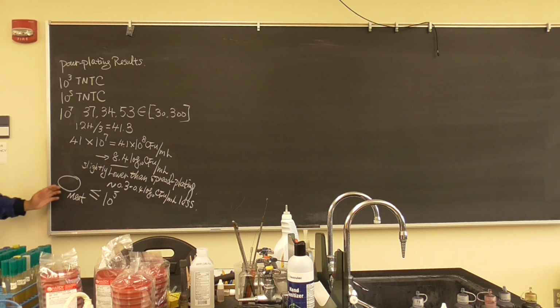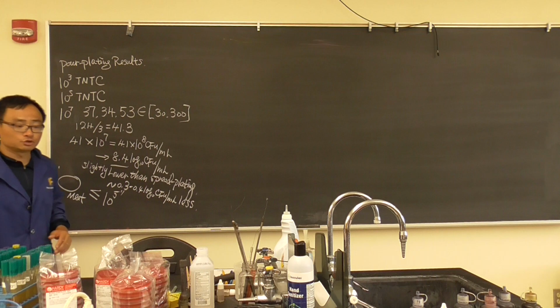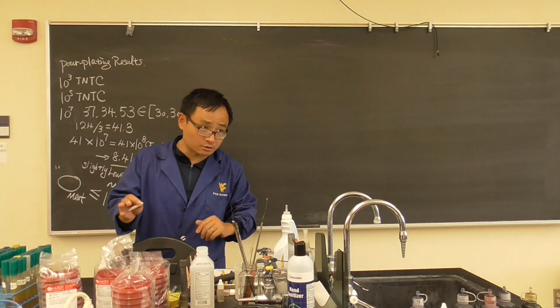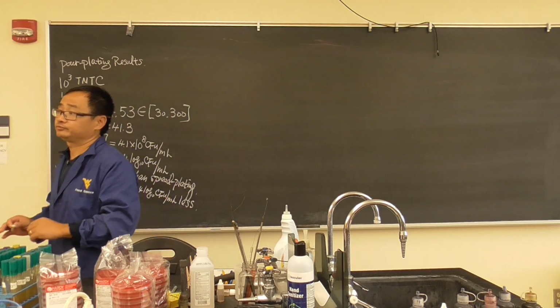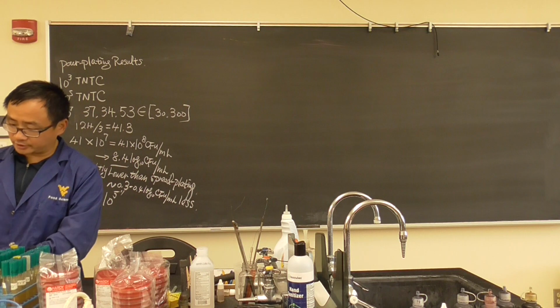So that type of thing is why people want to use pour plating. It did save you a day to make the media. However, you can compare the results, not that good. And it's even confusing. And it's hard to count because it's everywhere. Okay? So that's what we talk about the pour plating.